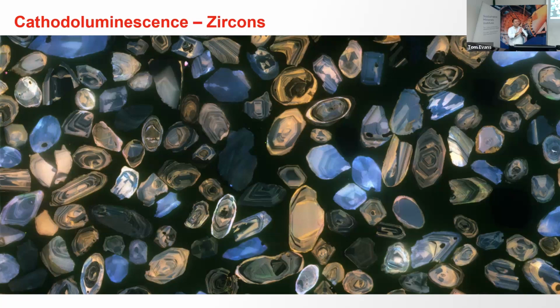To answer the first question, yes, we highly encourage using other analytical techniques. We are doing characterization work. One trouble sometimes is the idea that with automated mineralogy we don't need to do anything else. Well, not quite. When you have multiple techniques and these different techniques get to an agreement, that's what gives you the confidence in the results. So we always encourage you to keep using your XRD, keep using your XRF, but we're seeing a trend toward using analytical techniques that complement some of the limitations of automated mineralogy, for example isotope analysis and trace element analysis. It's becoming very popular, or it's been around for a while.